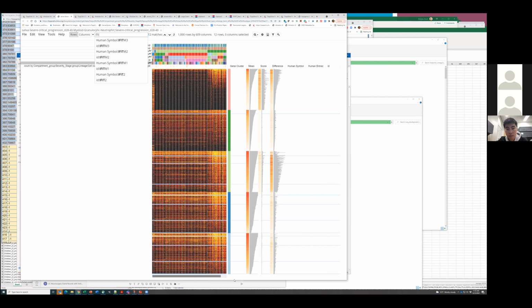And so here are all the IFIT genes in there, and you can see there's IFITM3, M2, M1, and as you go up this lineage, myeloid cell neutrophils are part of granulocytic myeloid cells, and they're generally part of myeloid cells. And then this was the group comparison of severe versus non-severe of day 28 to 40 in saliva. So these are trying to understand differentially expressed genes in saliva.